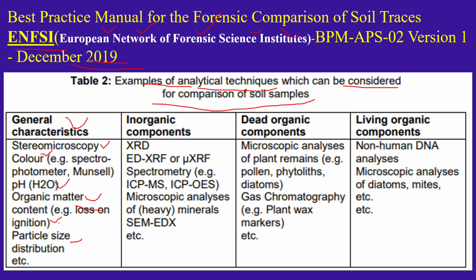For general characteristics and inorganic constituents, the soil can also be analyzed using techniques like XRD, XRF, spectrometry, ICP-MS, ICP-OES, microscopic analysis for heavy minerals, and SEM-EDX, the scanning electron microscope with energy dispersive analyzer. So these instruments may be used for the inorganic component.